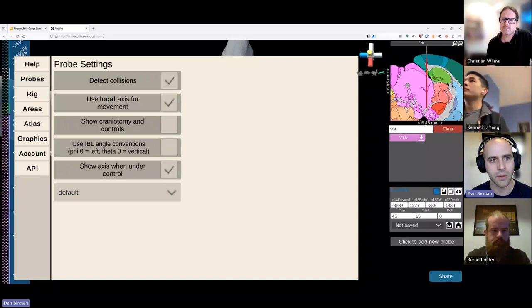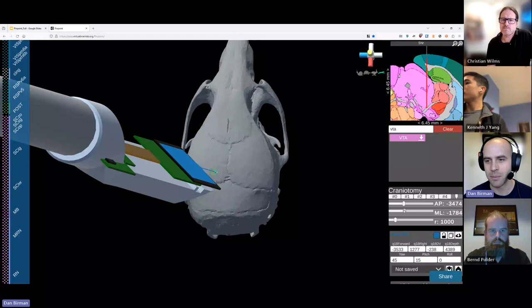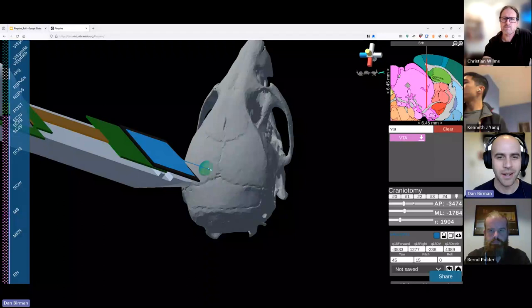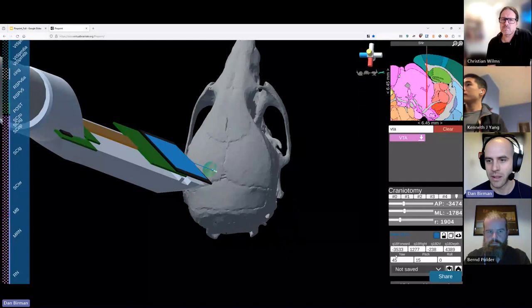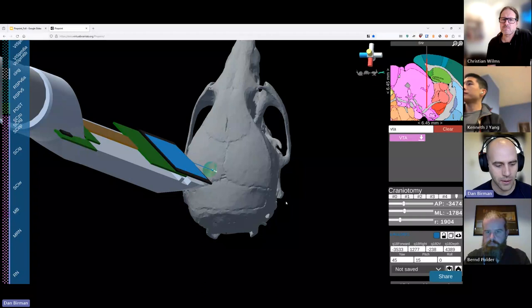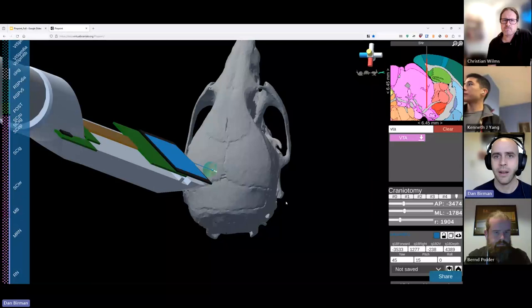We can also use the Mouse Skull to plan craniotomies. Under the settings menu, under Probes, there's a craniotomy feature. You can click one of these craniotomies and drag it along the AP and ML axes to position it and change its size. So here we have a craniotomy at some position relative to Bregma, and then we have our actual insertion with coordinates shown. We have videos and text tutorials on our website, virtualbrainlab.org, and there's also a link to our eLife paper with more tutorials.